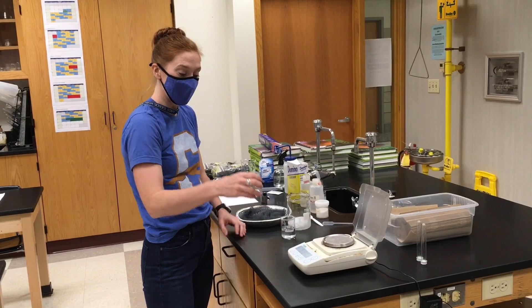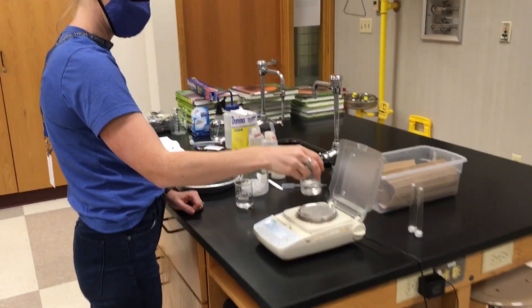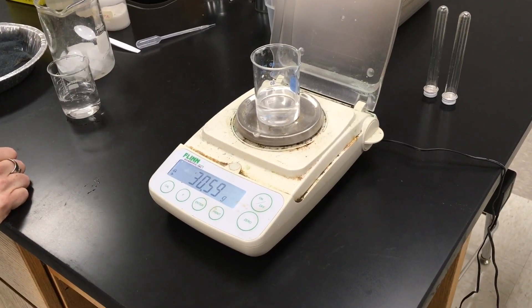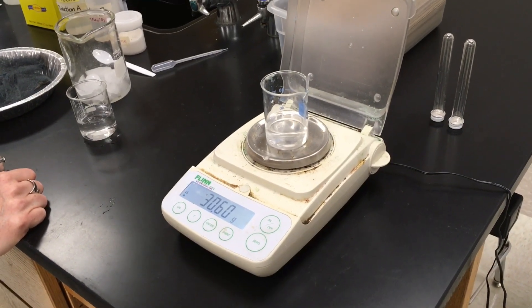Okay, so some time has passed. The ice has now melted from our beaker of ice and water, and we're going to re-mass this beaker to see that it is 30.60 grams.